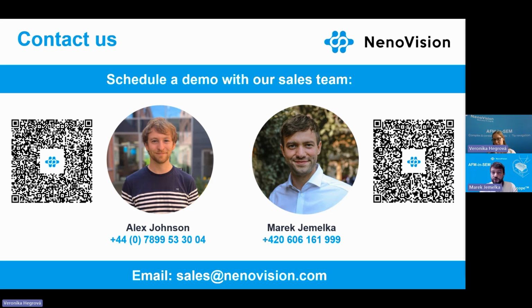I think, Veronica, you have help from Radek right there. I didn't find the question, so I didn't find the answer. Sorry, I don't know this from my head, but basically you can also FIB mill the structure so the cantilever can go even lower. So usually about 15 microns. Yeah, I found it out. Sorry for that. No worries. So there are plenty of layers you can analyze.